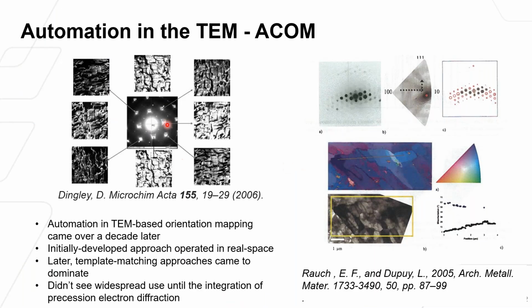So the David Dingley approach, this is very much an image-based technique, where you took a series of dark field images and used those dark field images to reconstruct a virtual diffraction pattern that you could then use to determine the orientation locally in the material.